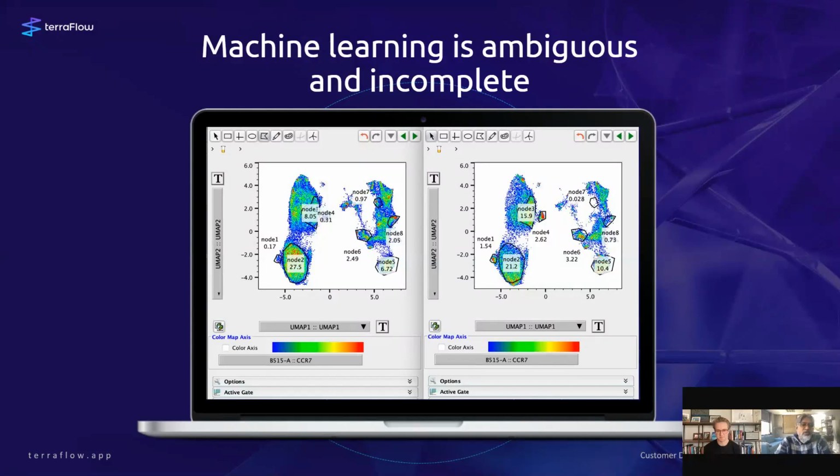And often when you compare these islands, you'll find that there's some subsection of the island, some neighborhood within the island that differs. That's really hard to define, and you don't get a specific phenotype that's actionable and interpretable easily from this type of information. Moreover, you can see that there's no statistics here. You just have to compare plot by plot, and you don't really know how much uncertainty there is in these systems. It's almost like they're a black box.